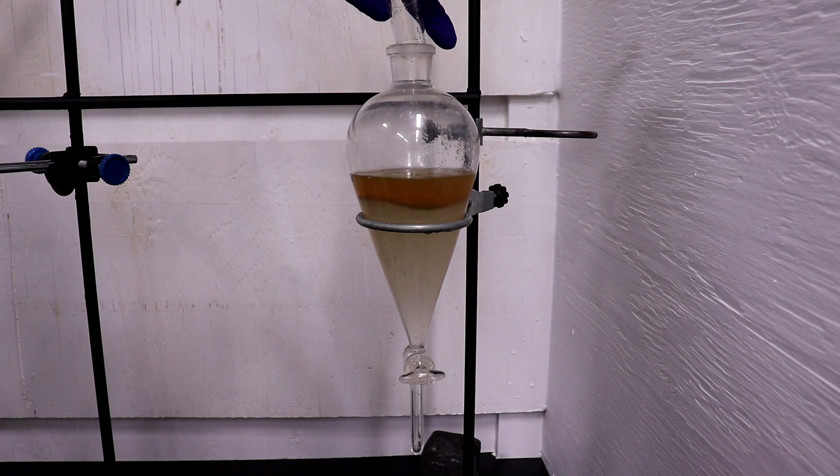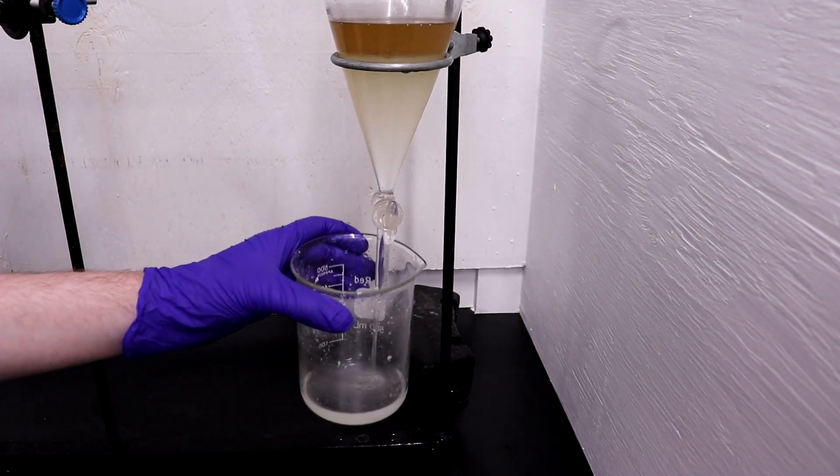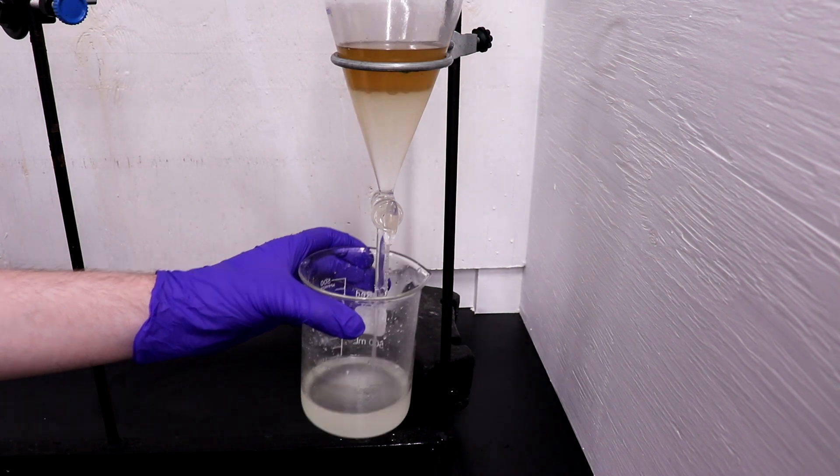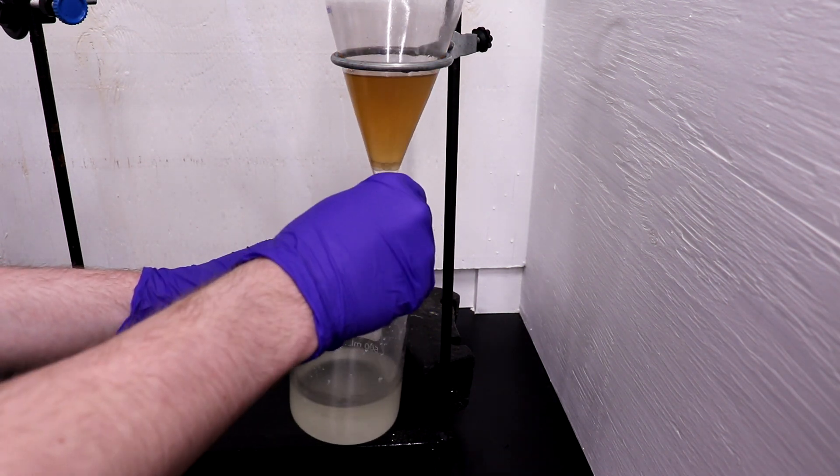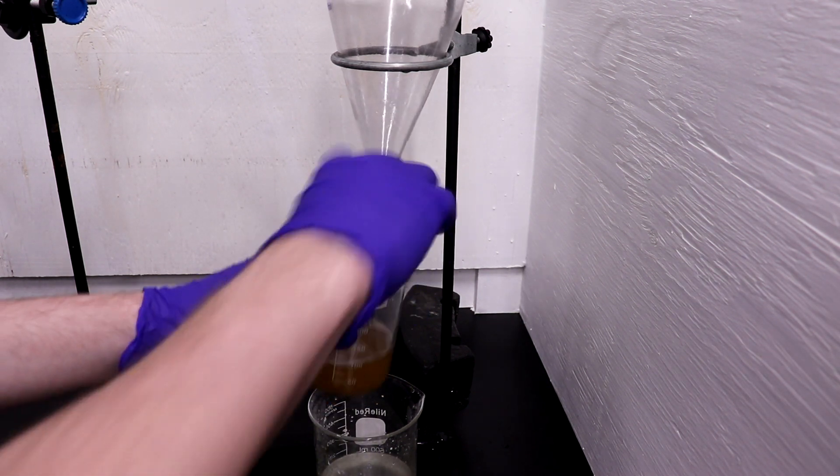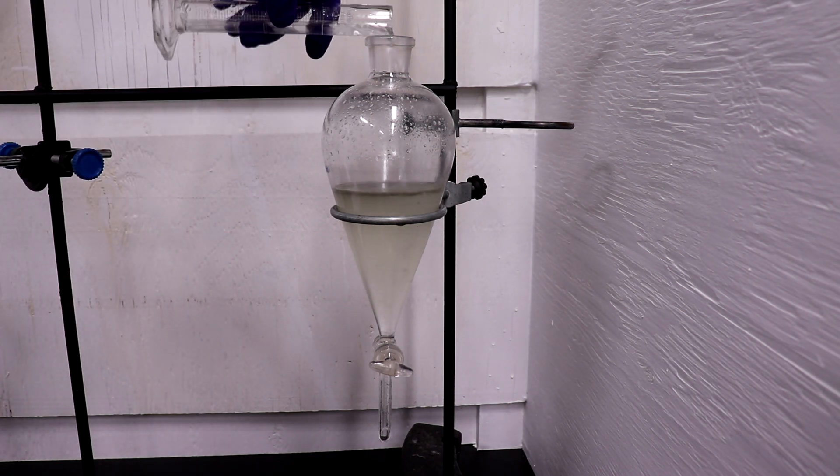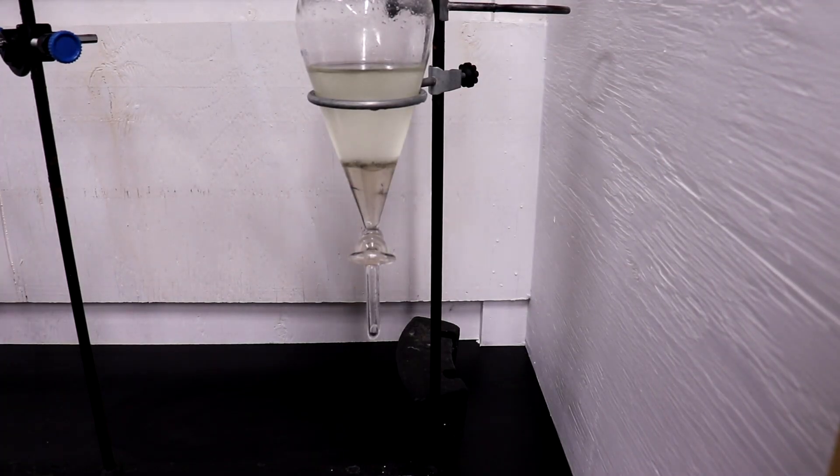I transferred the mixture to a separatory funnel and added 15 mls of DCM. Then, I removed the organic layer and replaced it with the aqueous layer, followed by an additional 15 mls of DCM. After shaking, the DCM layer was removed and added to the toluene solution.